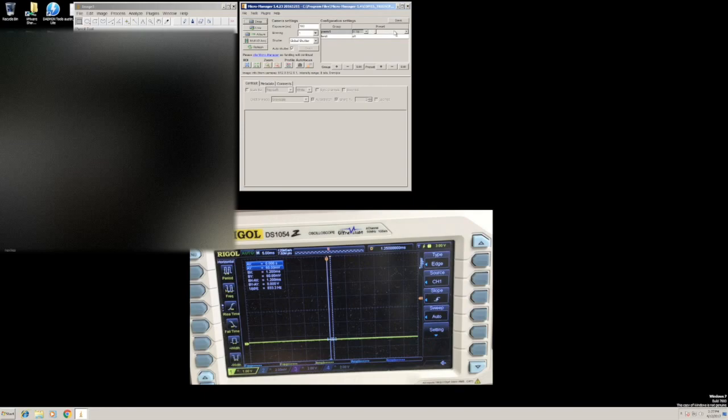Now this is basically like what normally would be DAC1 on the Triggerscope. So I've got a DAC line with a value range. This value range now controls pulse width modulation. The other thing I've got here is the on and off state, which shows up as a TTL value.